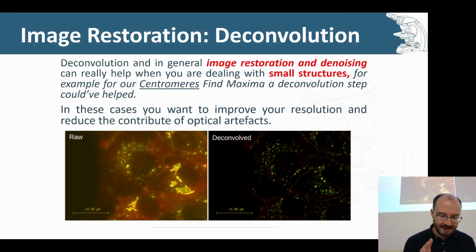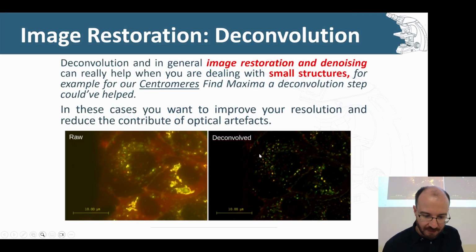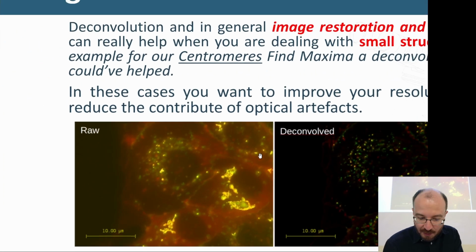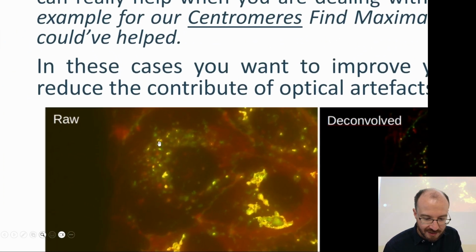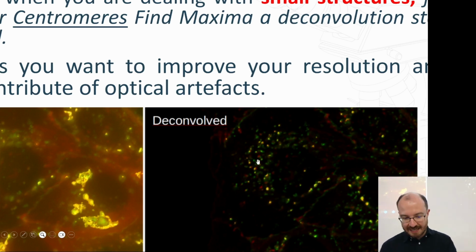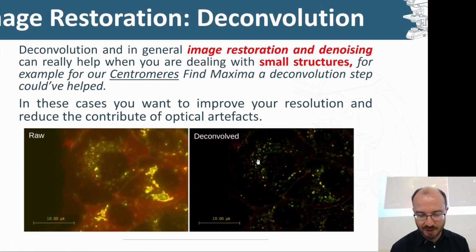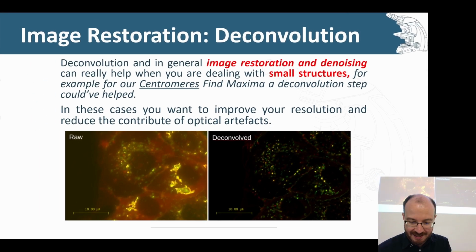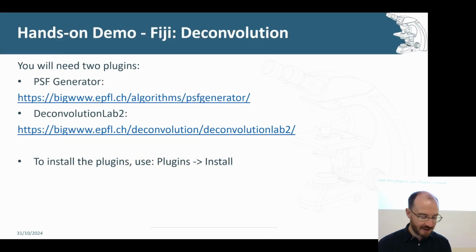All right, so then, I think this is just another example of the same thing. One of the main reasons why we want to do deconvolution is, for example, a structure count. It's going to be difficult to count the number of structures I see here because they're all blurred together, whereas if it's cleaned up, I can suddenly see where the structures actually are, and then analysis is more accurate. I think I've made that point, but that's the reason why we deconvolve: so that we can make sensible analyses from that.